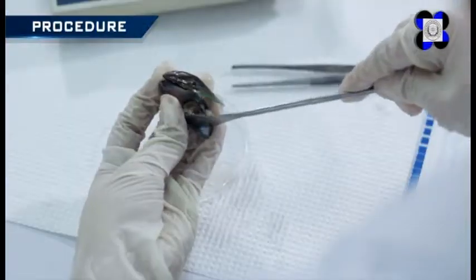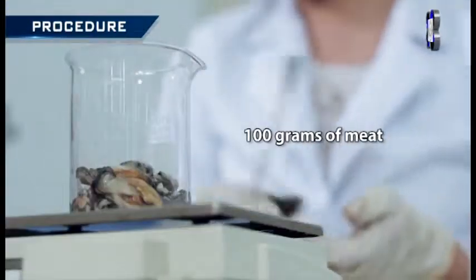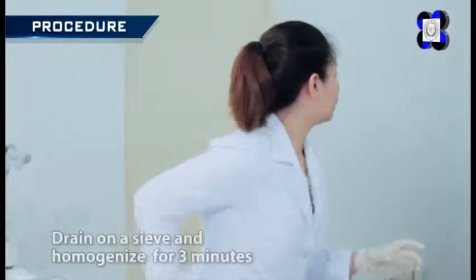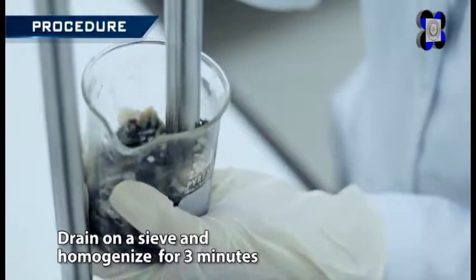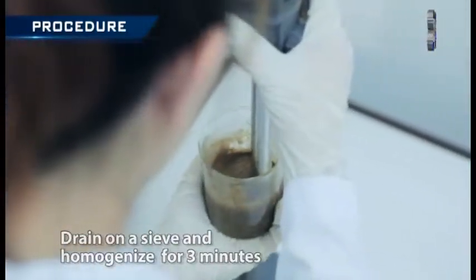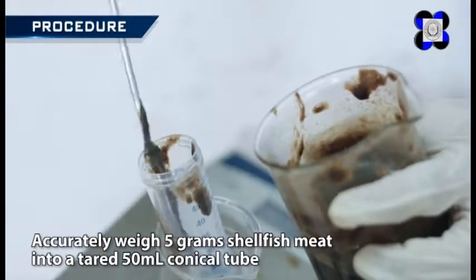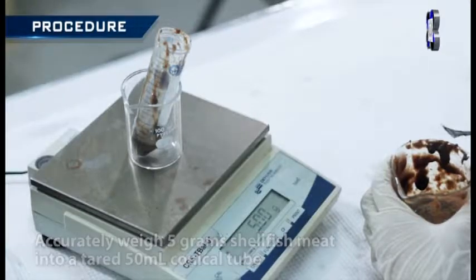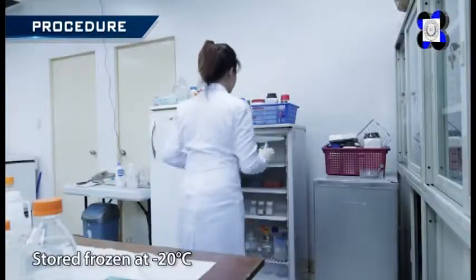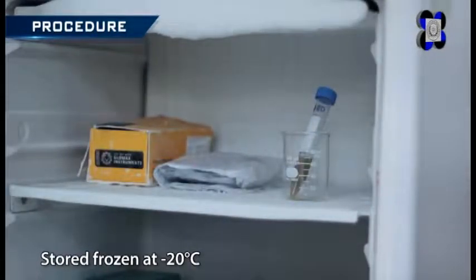Shuck shellfish to obtain approximately 100 grams of meat. Drain on a sieve and homogenize for 3 minutes using a blender or a homogenizer. Accurately weigh 5 grams of shellfish meat into a tarred 50 milliliters conical tube. Excess homogenate may be stored frozen at negative 20 degrees Celsius.